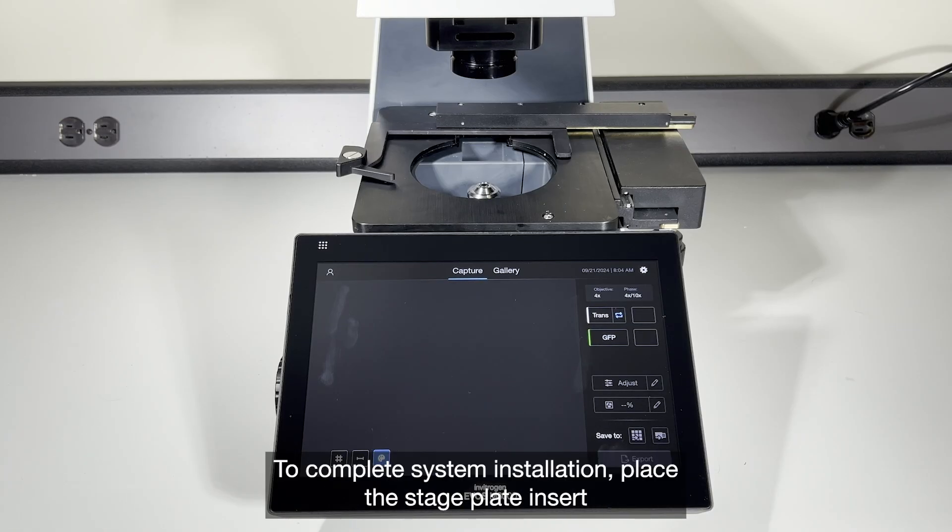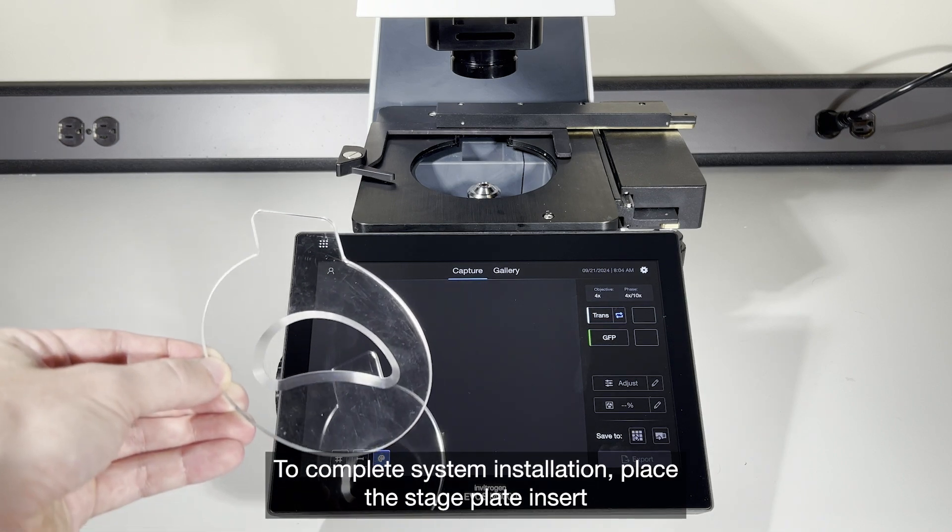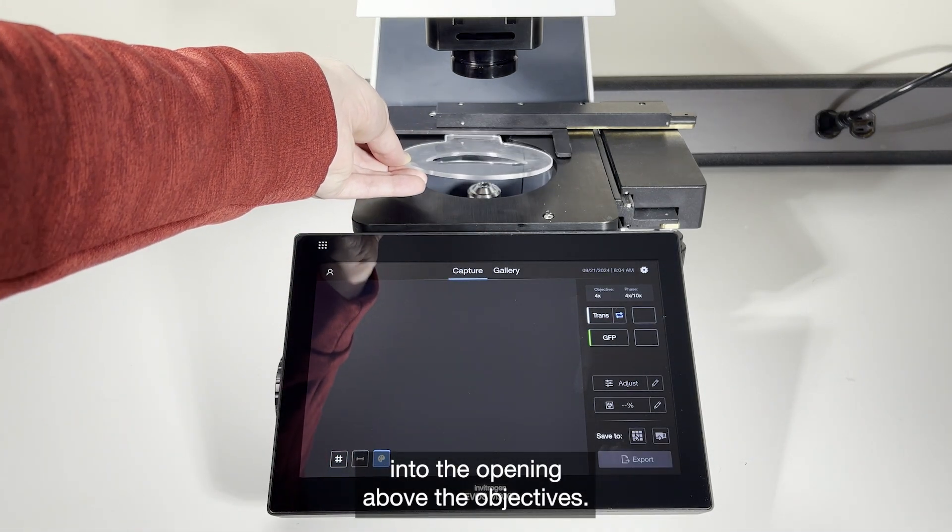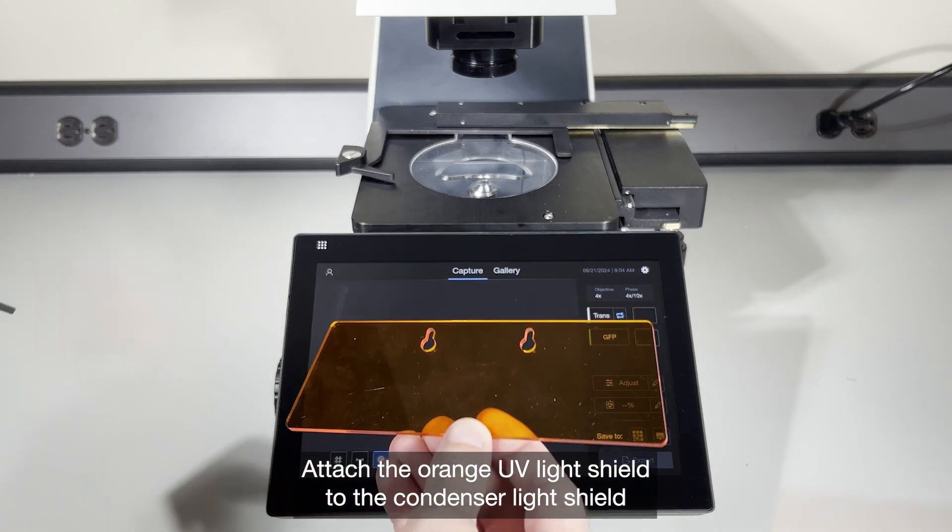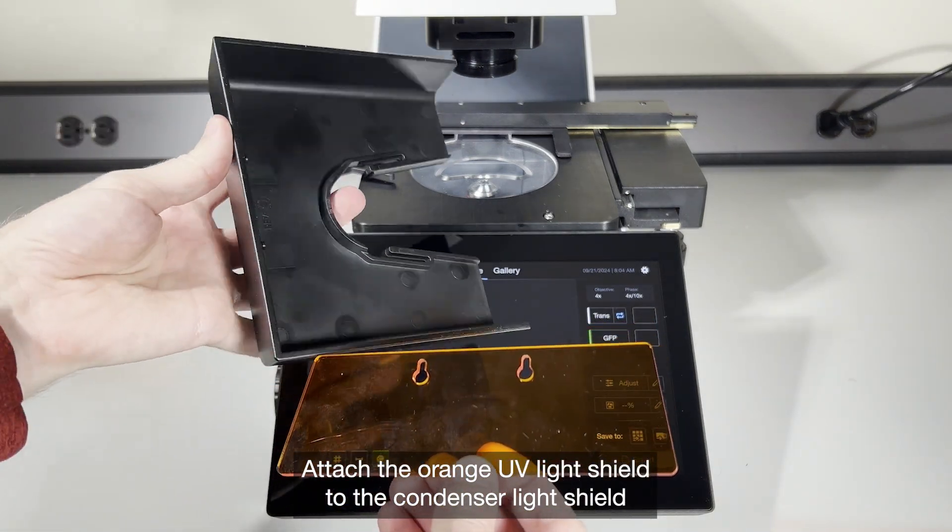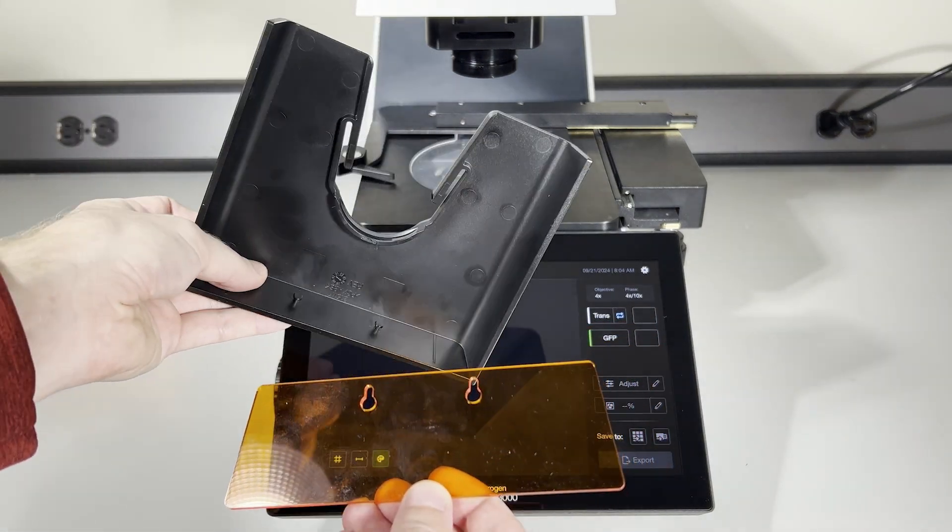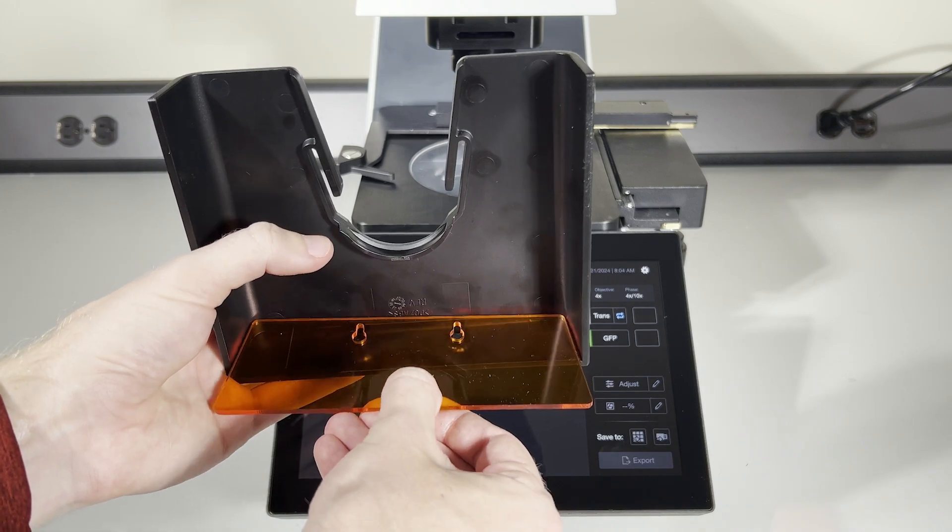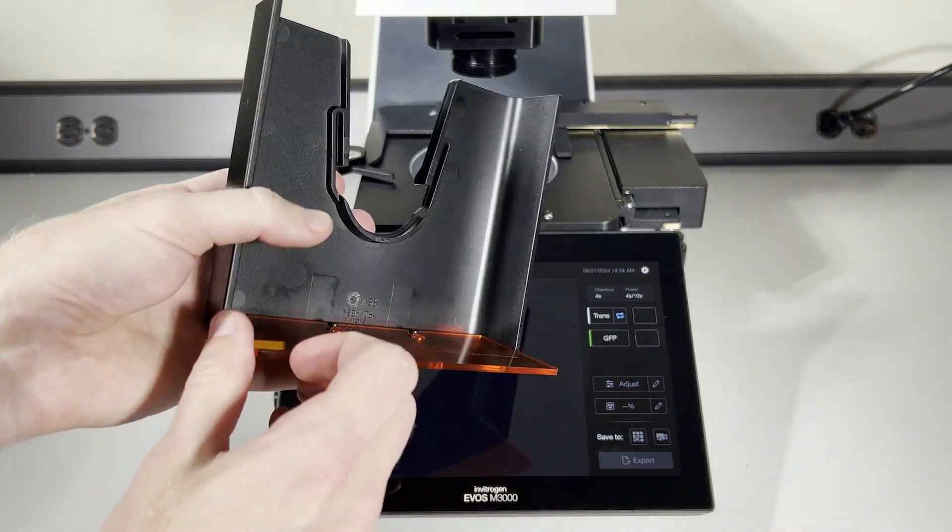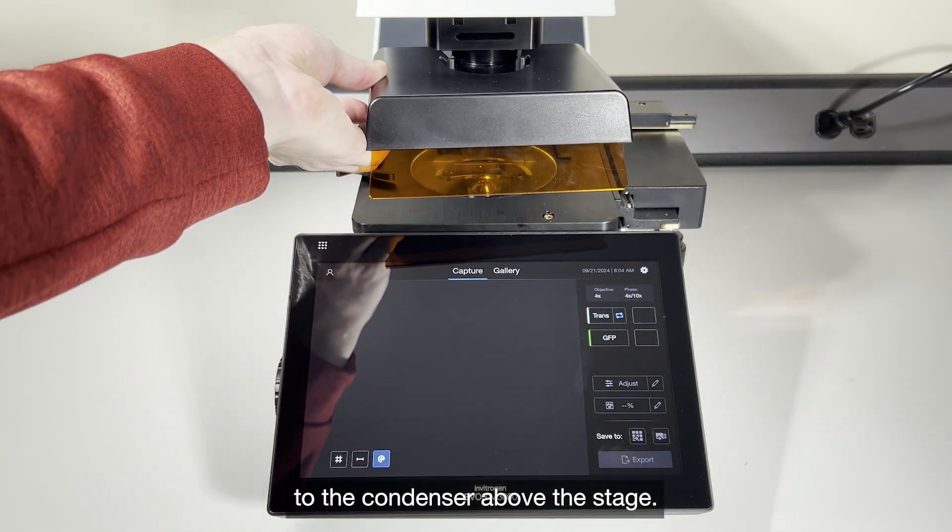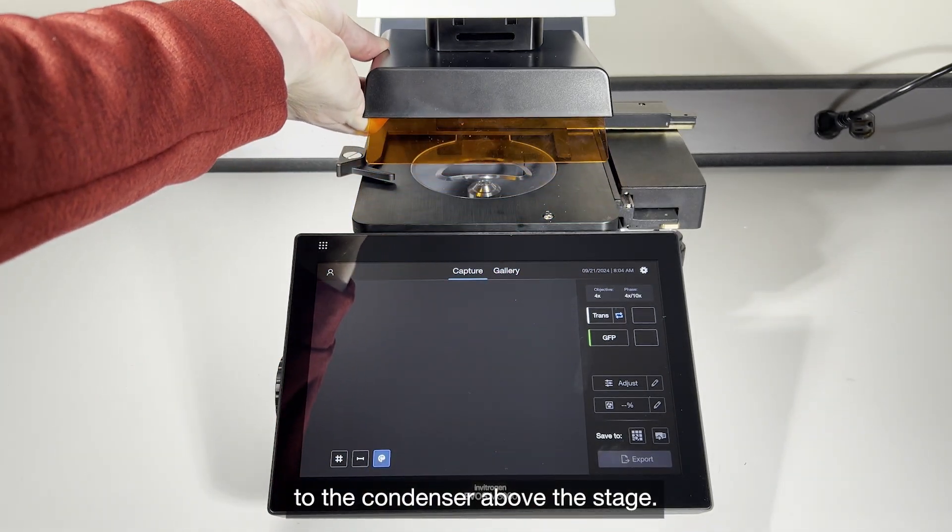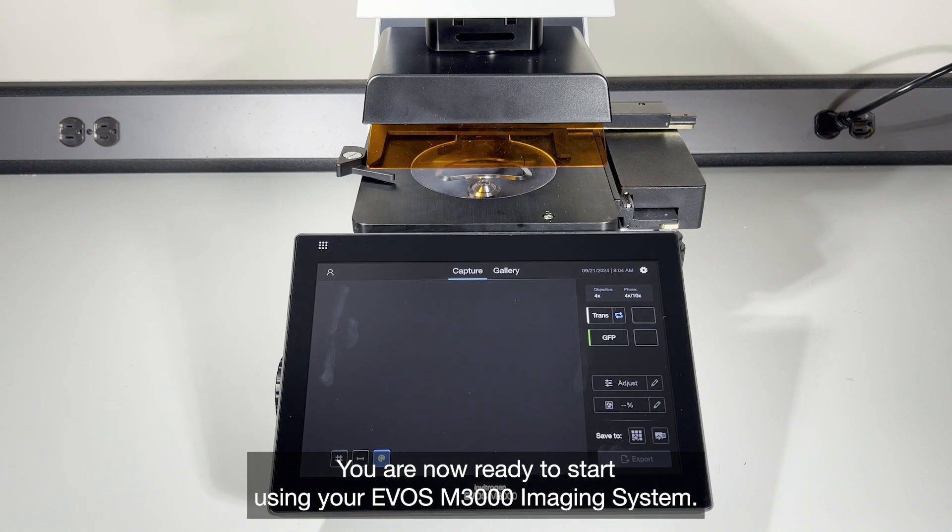To complete system installation, place the stage plate insert into the opening above the objectives. Attach the orange UV light shield to the condenser light shield and clip the shield to the condenser above the stage. You are now ready to start using your EVOS M3000 imaging system.